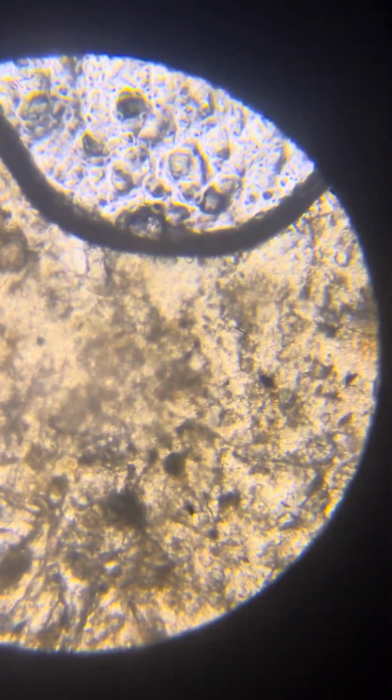As I said many times, you can watch them at any magnification, almost to the point that they're visible by the naked eye. Not in vanilla, not in things taken from my body, but in a large one in a laboratory environment. And even at 1500 magnification you can still see it. So probably in the nanoscopic way, maybe the subatomic way, who knows?